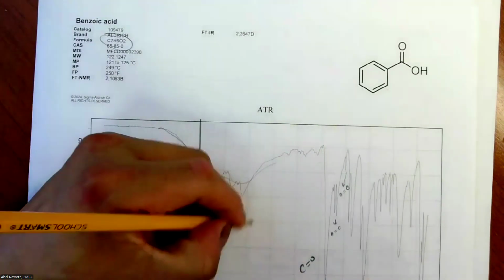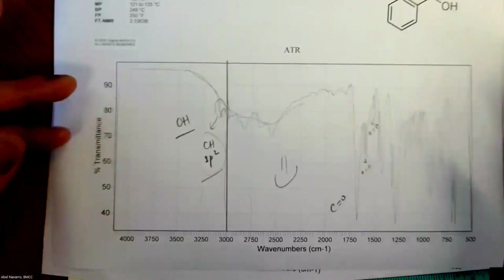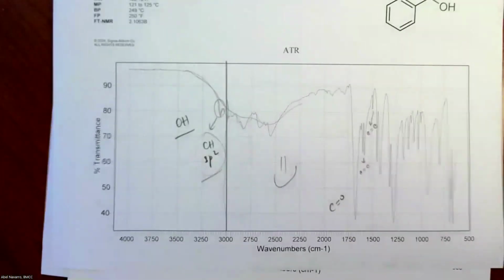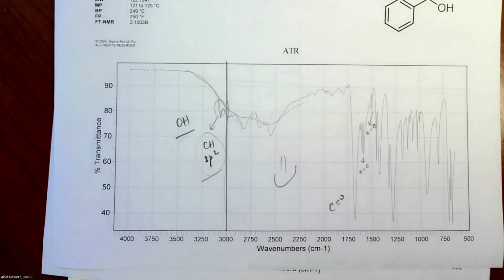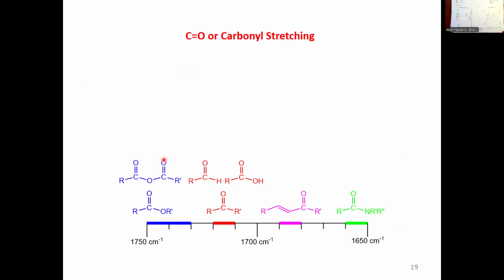Okay, good. Any questions? If not, we're done with this particular IR spectrum. That's what we call assignment. IR assignment is done by identifying each of those peaks. All right. Great. So we know what a carboxylic acid is, what an amide is, an OH, and now the carbonyl. We're right now on the right side of the IR spectrum. So we're almost done.